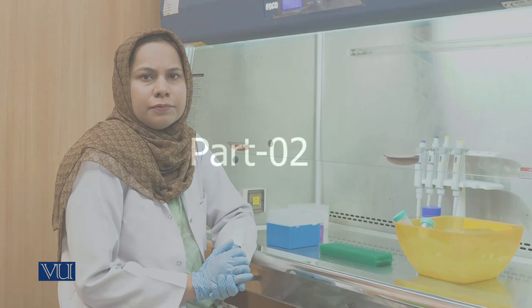Competent cells have been prepared with glycerol. We can store these competent cells at minus 80 degrees centigrade for a few months.